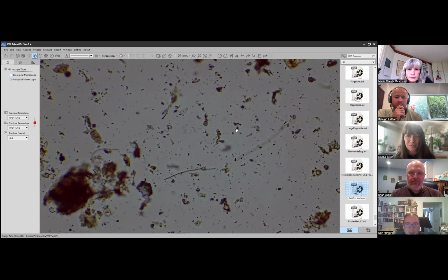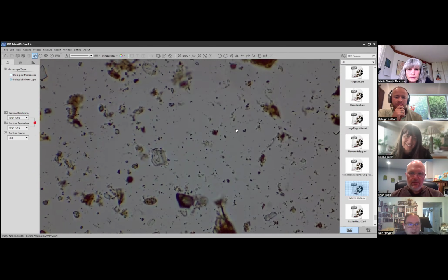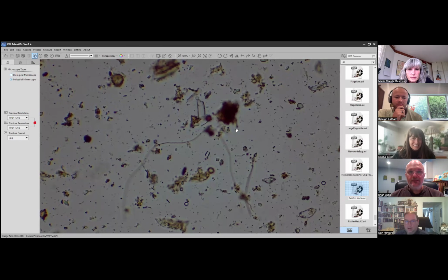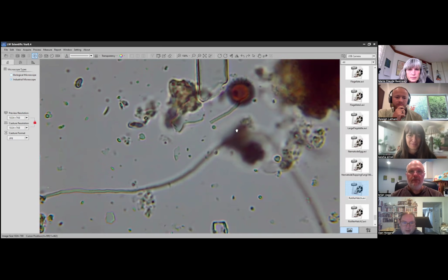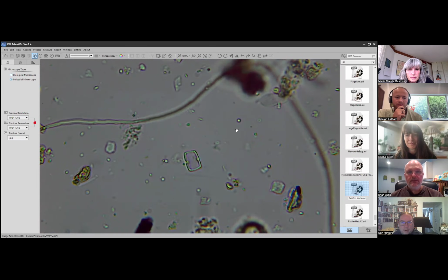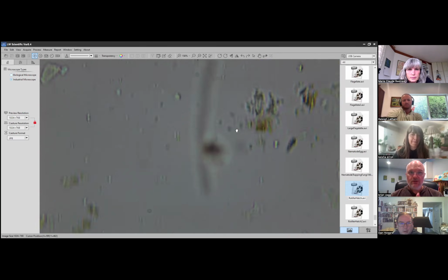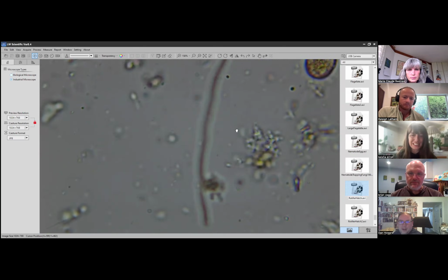Tons of fungal spores, good aggregation. Yeah, this is great quality compost. And so this is where we would go through and assess, right? We look at this compost and go, yeah, this would be great inoculum for making compost extracts or compost teas or using it in your planter beds. You would expect, if you're using this on a really poor soil as a tool to start to rehabilitate, to inoculate that soil with microbes. So fantastic, Dan.